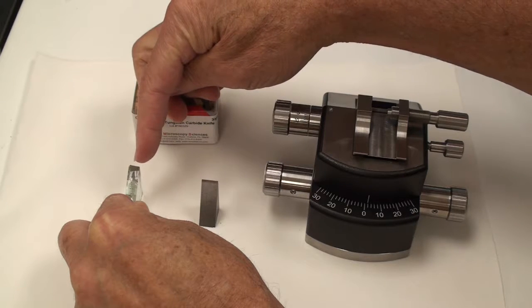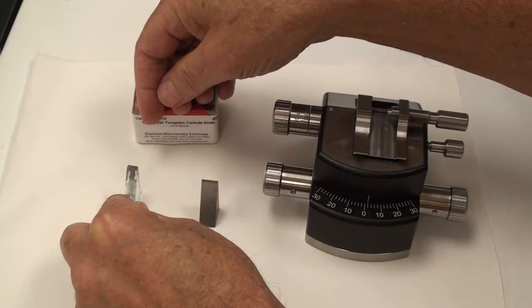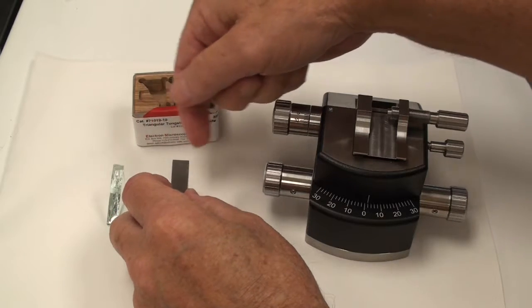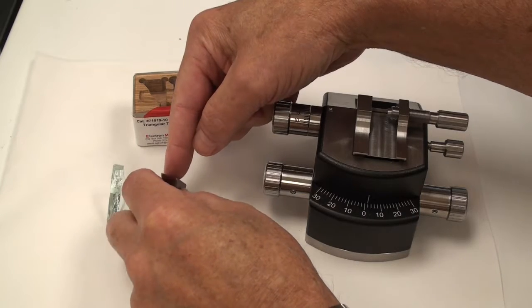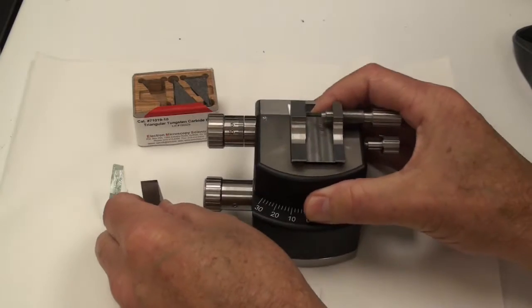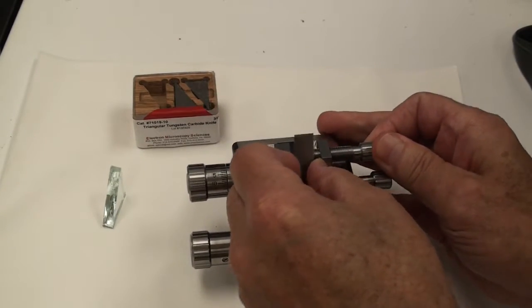The problem with glass is the back of it is slightly curved, and so then your block face has a curvature to it. One thing nice about this tungsten carbide knife, the DDK, is that it's flat across the back. And that way then your block face is planar, so when you cut it with a diamond, it doesn't have edge and curvature to the block face.